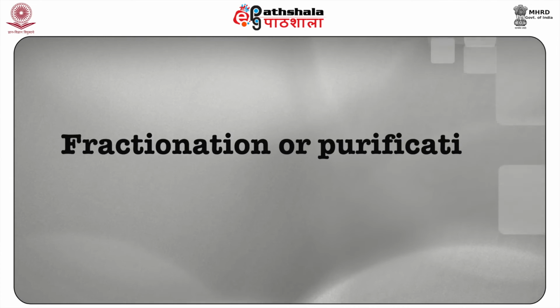Third is fractionation or purification. The availability of a large variety of gel media, for example dextran, polyacrylamide, agarose, and also note we have given you a table which states many other gels available in the market, with varying fractionation ranges, has extended the use of this technique for separation as well as purification of biological materials ranging from low molecular weight compounds like sugars, polymers like proteins and nucleic acids, to superstructures such as viruses.